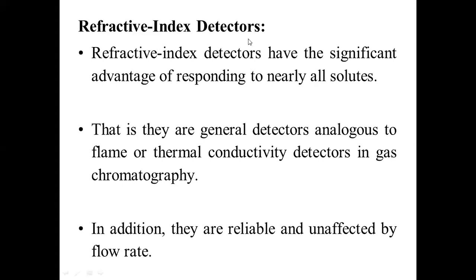The next class of detectors is the refractive index detectors. Here, the refractive index is one of the properties we are going to measure after the separation of the solute molecule is over. We will take the difference between the refractive index of the mobile phase or a reference and the refractive index of the solute in the presence of mobile phase.